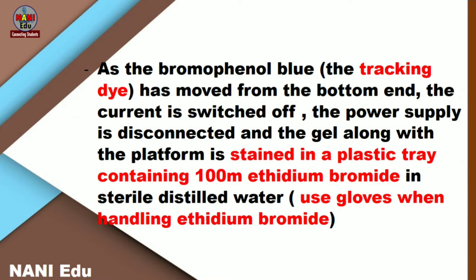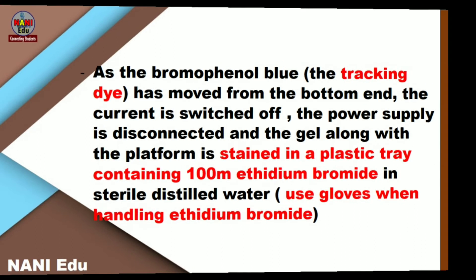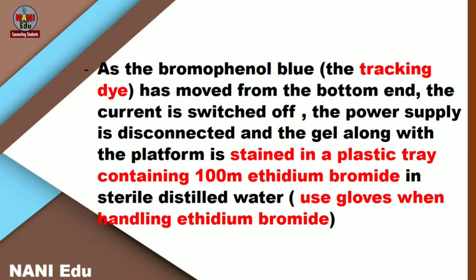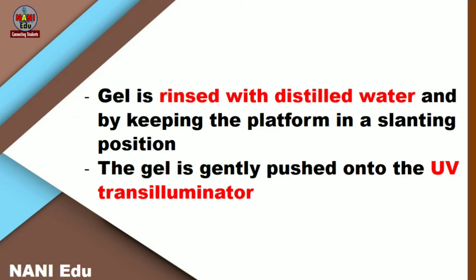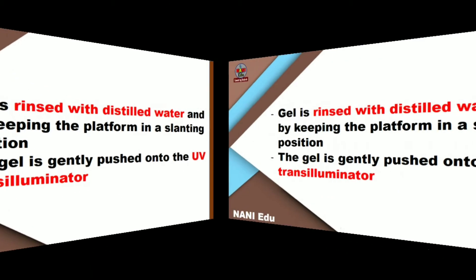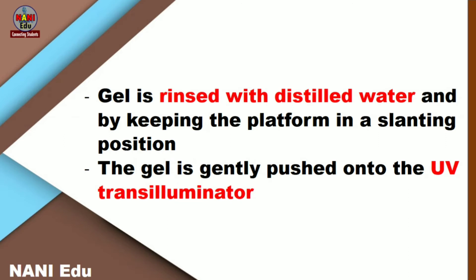When you load the gel in the well, the bromophenol blue — it is called the tracking dye — it moves from the bottom end when the current is switched on at low voltage. When it crosses the well, you can increase the voltage — that is very important. After running the gel, you have to stain with ethidium bromide. We are adding the ethidium bromide inside the tank buffer rather than using a staining tray. When you use ethidium bromide, always wear gloves.